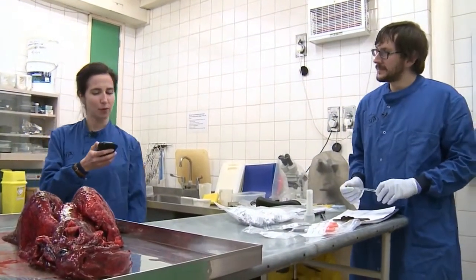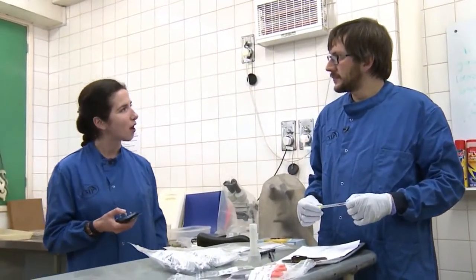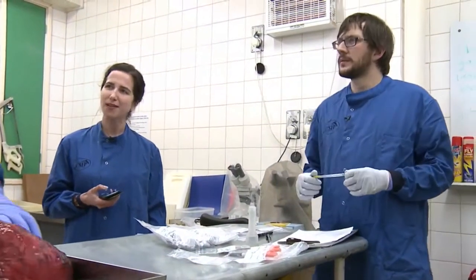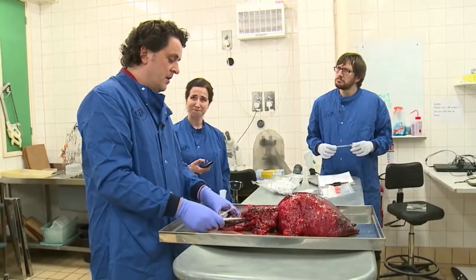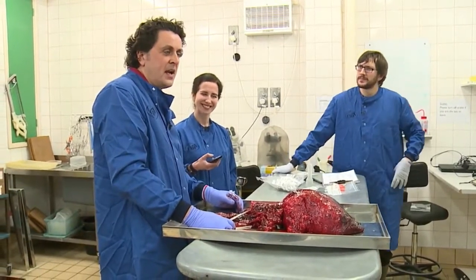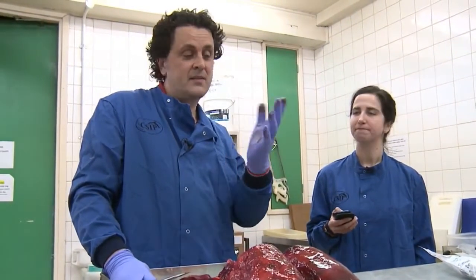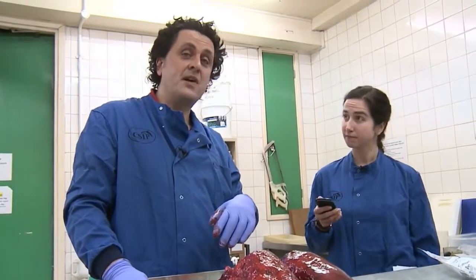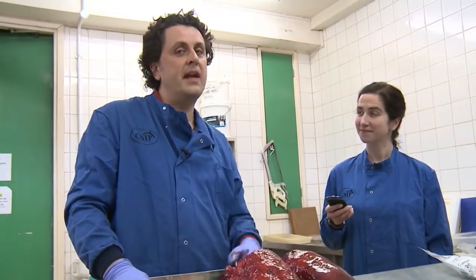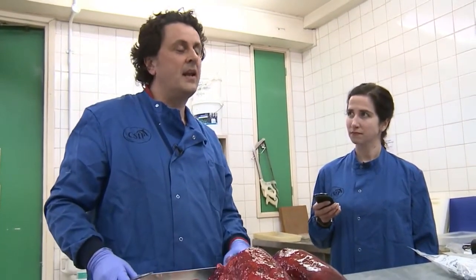Matt, we've also had a question through from Rosie and her children. They've asked why you and Rob aren't wearing, and I suppose me too, aren't wearing masks. Is it necessary to wear masks for this kind of work? Thank you for the question. They do carry what's called zoonoses, which are diseases that can affect humans. But really the risk to us is through cutting, so that's why we wear a cut-proof glove. It's not really from the aerosol. At the end of the post-mortem, if we have time, we'll try and take the brain out, and you'll see we do have a mask going over the front of the head, to try and prevent inhalation that way. But it's not really a risk, it's mainly about sharp blades on the hand rather than inhalation risk.